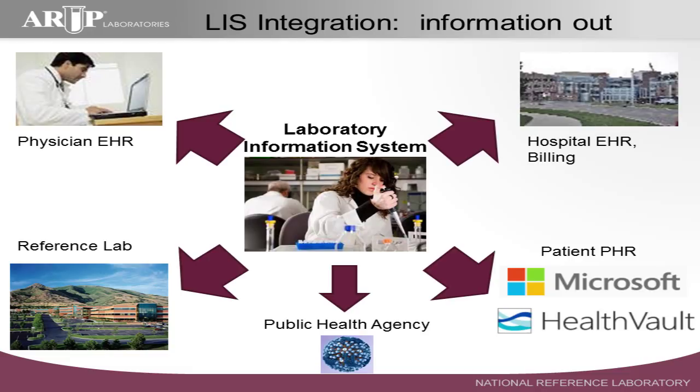But this slide is showing it as though the LIS is a standalone information system, because that's typically the case that you'll encounter. The LIS is a separate information system from all the others used in the hospital or elsewhere in healthcare. So another typical type of interface or information exchange you might see with an LIS is with the physician EMR.